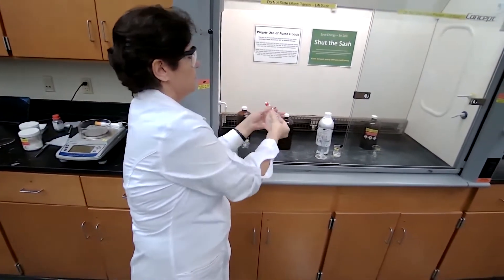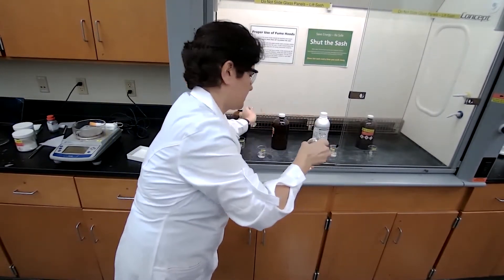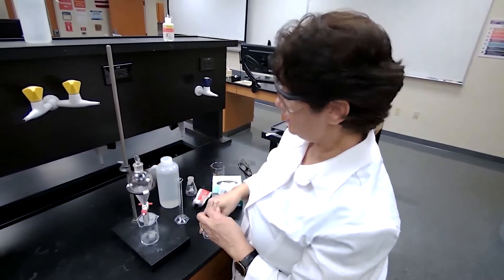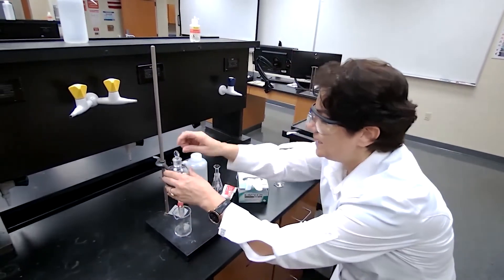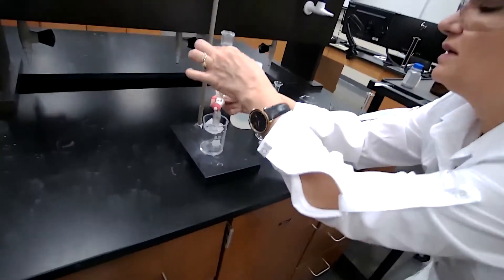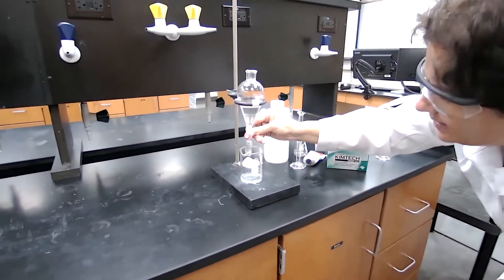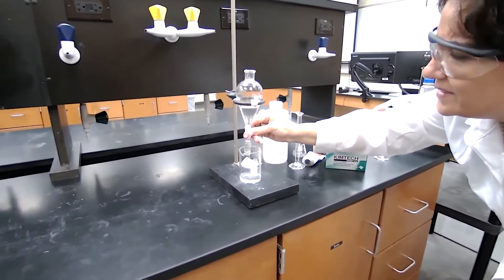Do this about three times. Place it back on the stand and collect the second extraction solution into the same beaker — the receiving container — and drain it without getting any organic layer into the beaker.